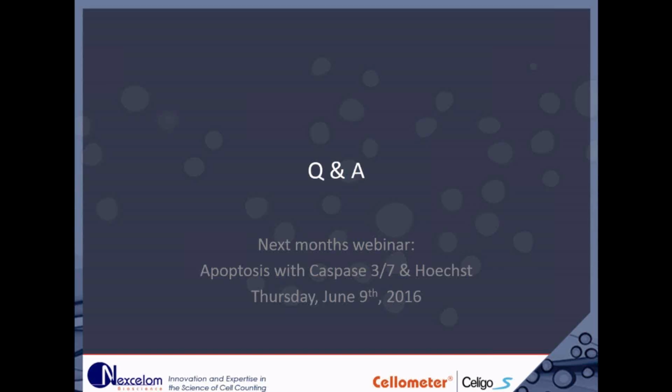All right, so your next question, Sarah, is asking, does setting different offsets for each channel increase the time of image acquisition? The Z position changes for those different focal offsets for the different channels isn't that much. You wouldn't even notice it. I would say where you lose time, or where you get slowed down, is when you have increased exposure time.